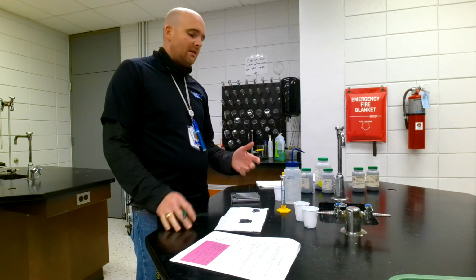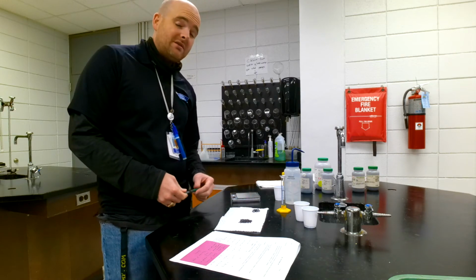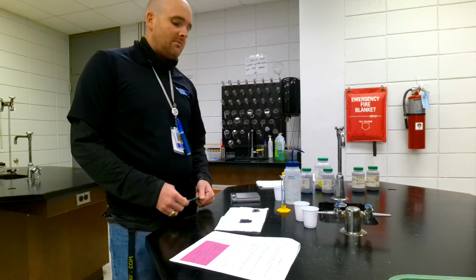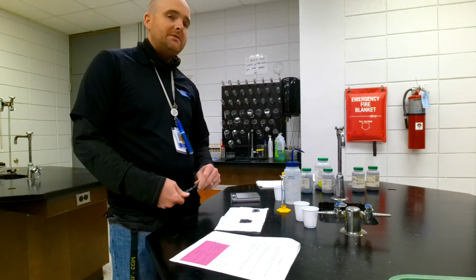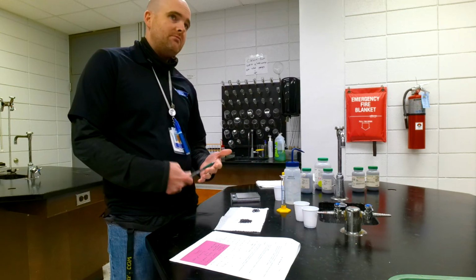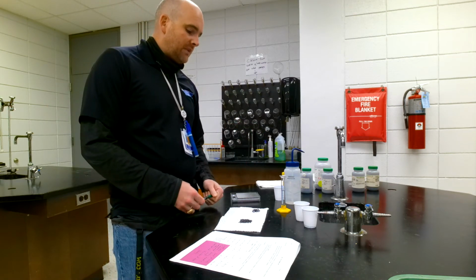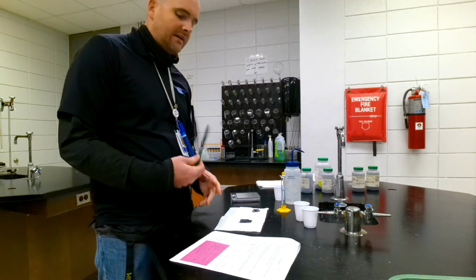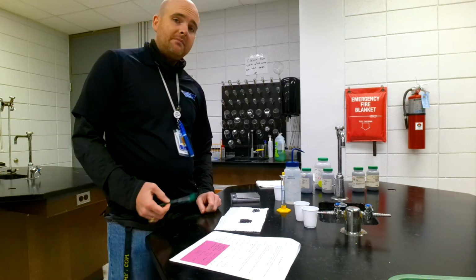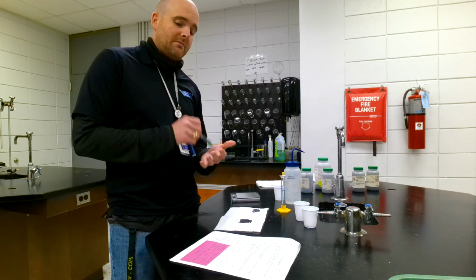So there's a couple of things that you might want to think about. Well, first off, the purity of the sample may be in question. We obtained these, and I'm not sure how old they are. They could be coated. Metals have a big tendency to coat themselves, react with oxygen, to maybe lead, might make lead oxide, which will have a different density. Maybe silicon actually could make sand, silicon oxide, silicon dioxide, or other things like that. So the purity of the sample could be in question.